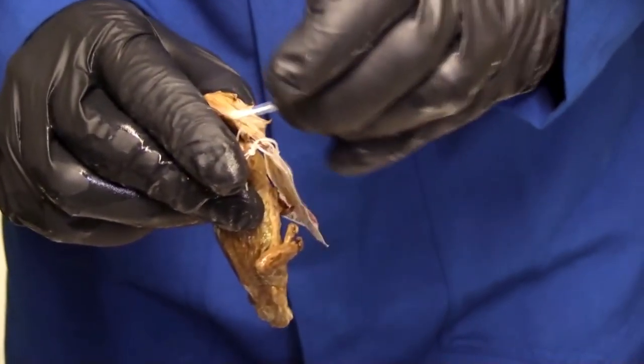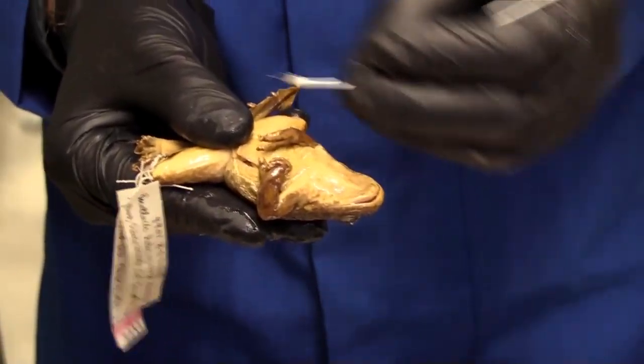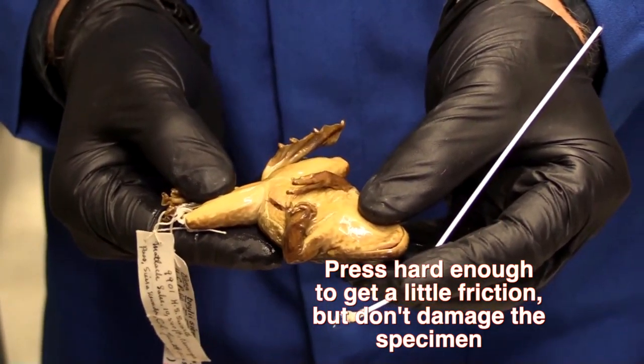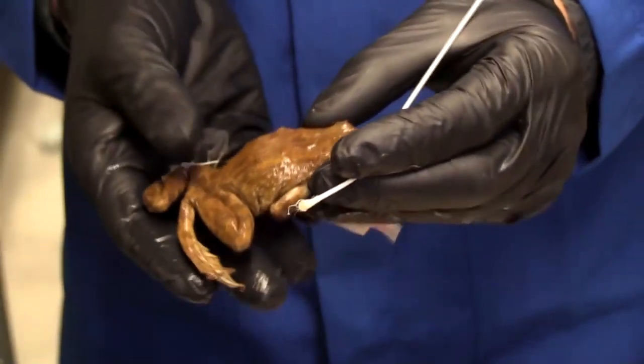Notice that the little hairs on the swab are actually pulled out — that's good, it means I've been getting a little bit of friction on the animal. And if you look at the animal, it still looks perfectly fine. I haven't ripped the skin or anything. These specimens are priceless, so I'm going to be very careful and put it down.